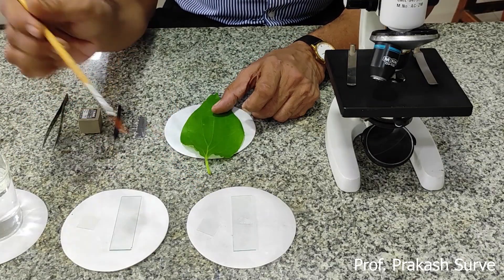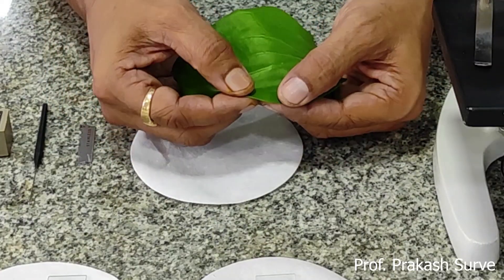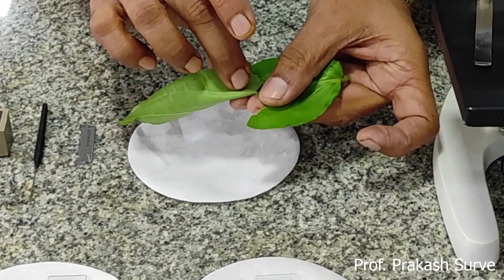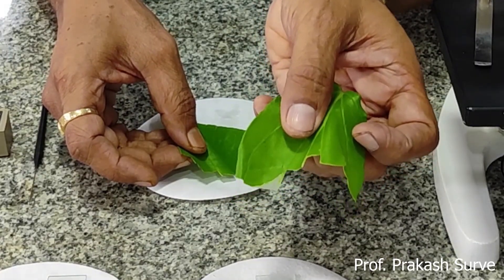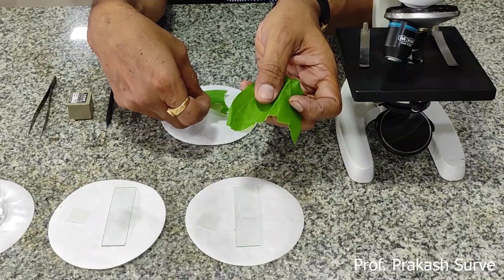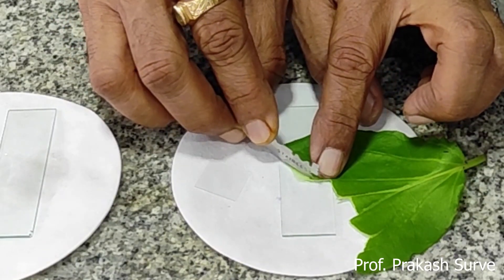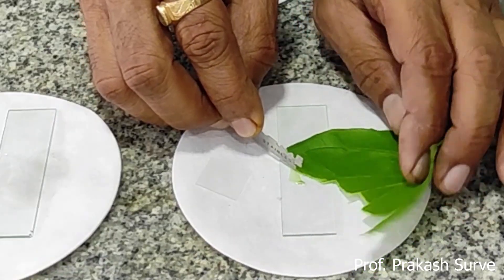First we will take a drop of water on one of the slides, and also on the other slide. You have to hold the leaf so that the upper epidermis is on the upper side. Just tear the leaf and pull it towards you. What comes in your right hand is the upper epidermis and what comes in your left hand is the lower epidermis. We can see clearly the lower epidermal layer. First we will take the lower epidermis, which has a very nice clear epidermal layer, and we will keep this on the slide in the drop of water, cutting the portion which is easily recognized.